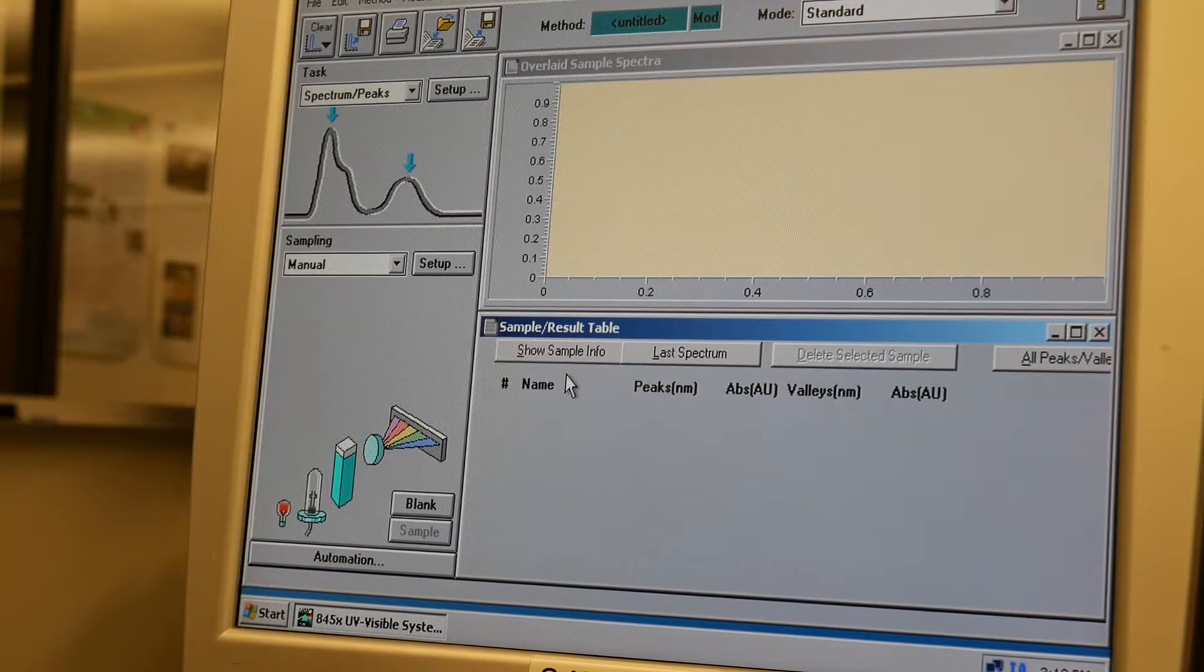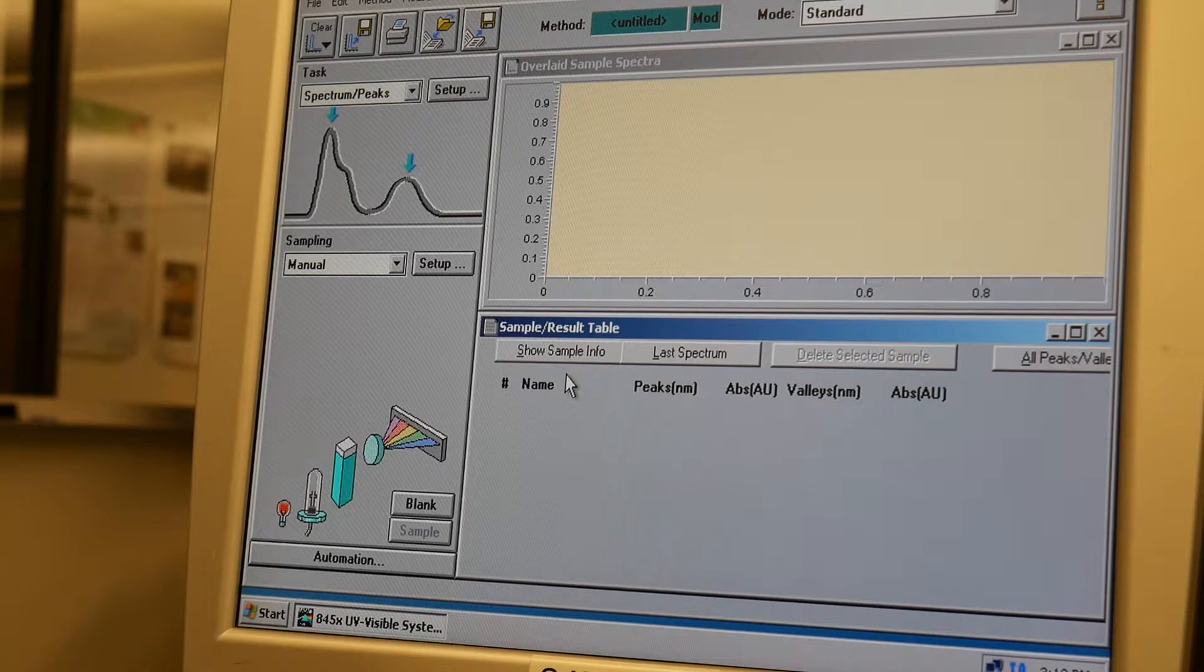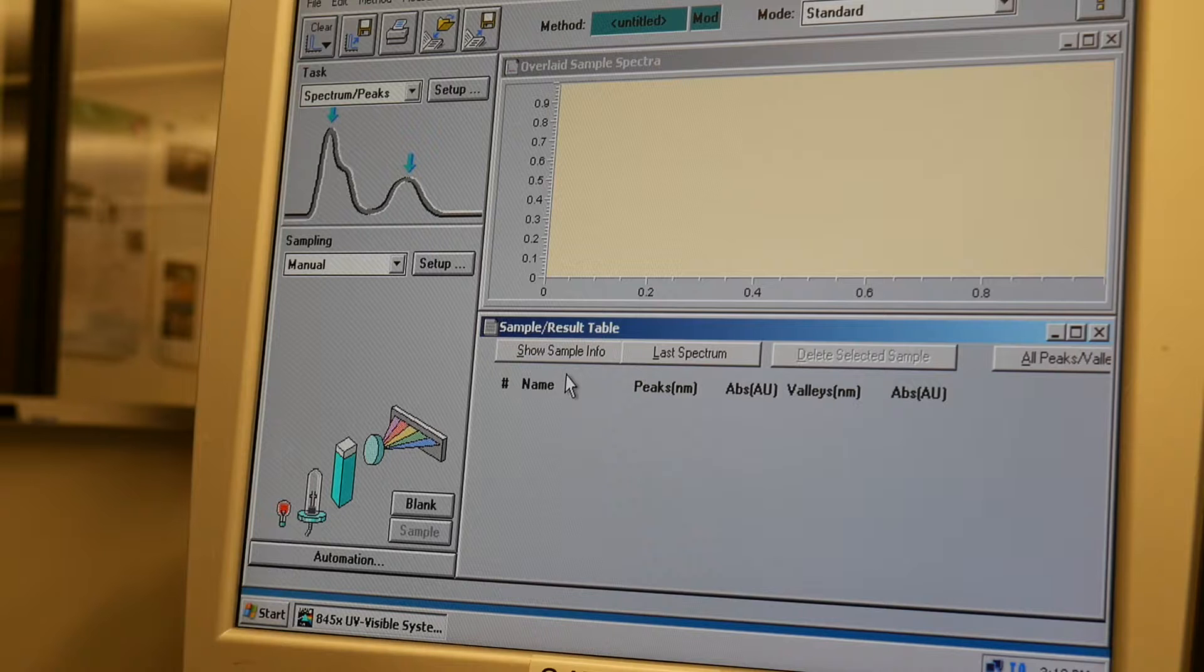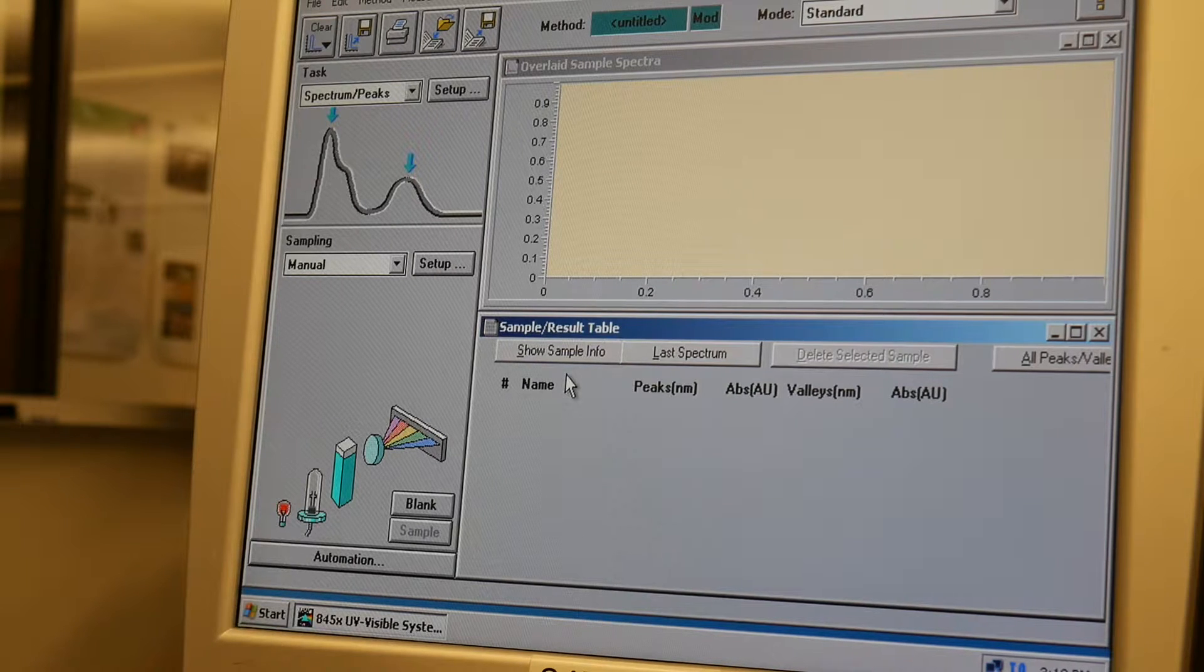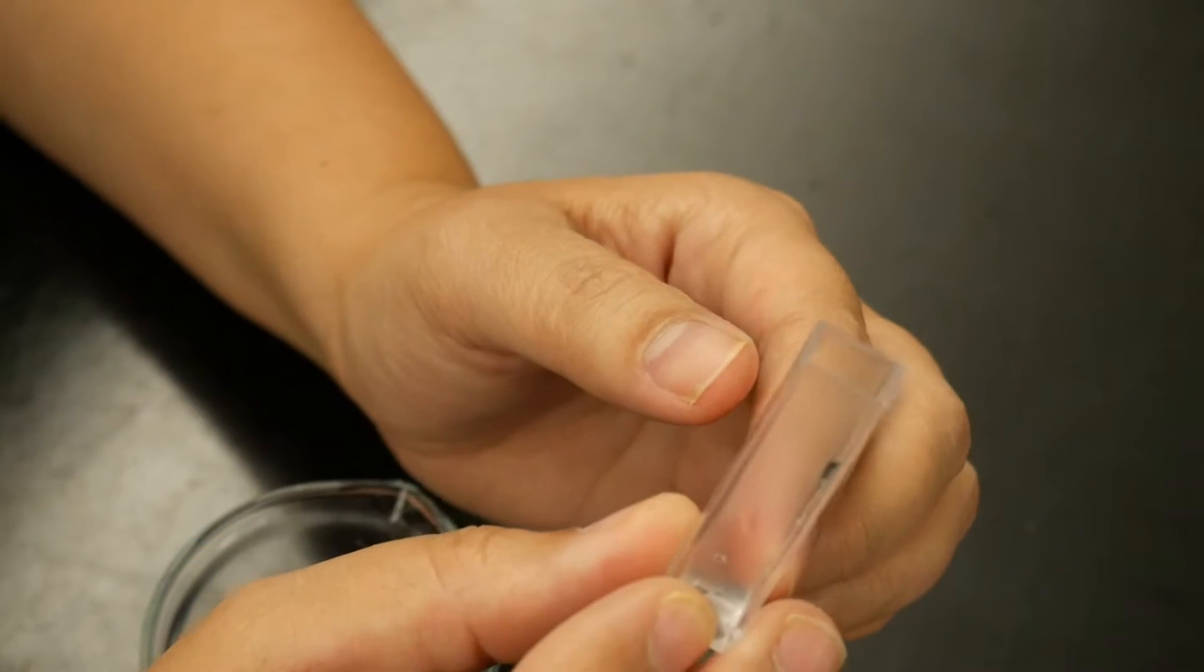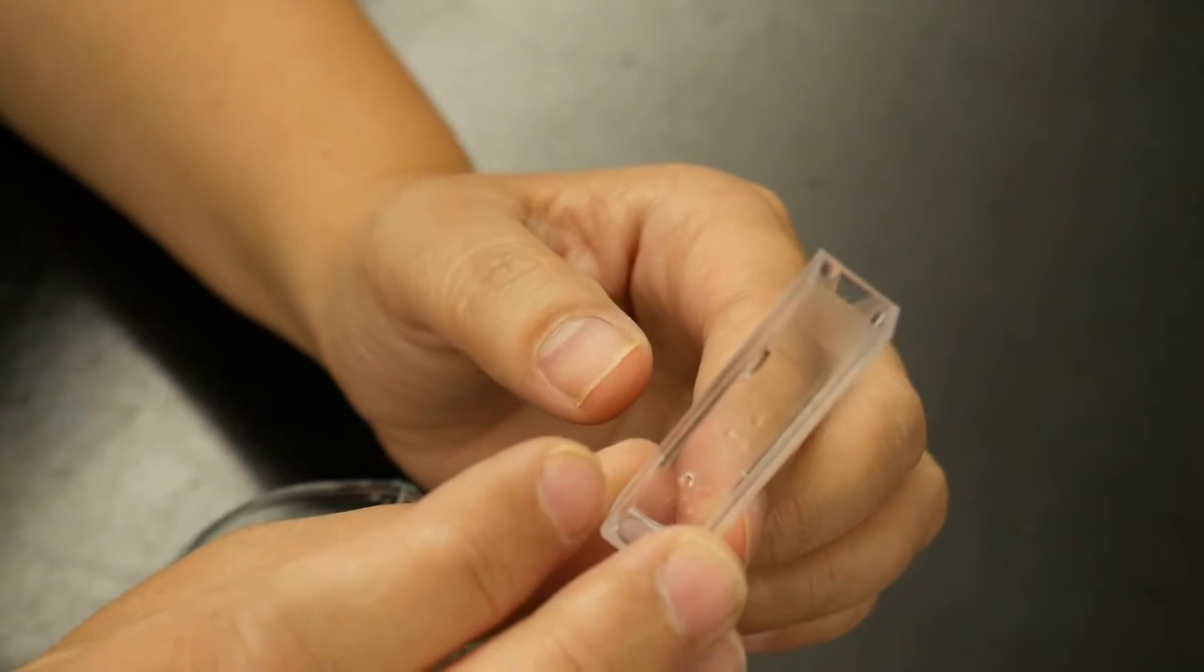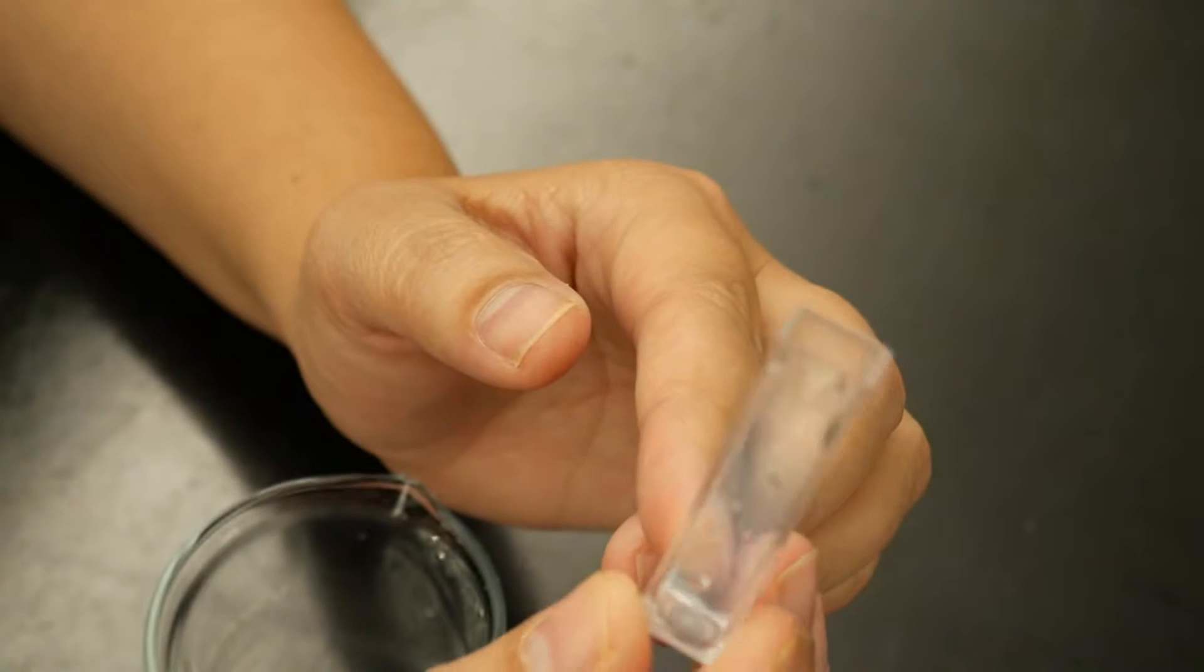And the first thing you want to do before you run any samples is you want to run a blank. And so if you are looking at something where you have reacted something, like if you're doing a colorimetric method, you'll want to do a reagent blank. But for now I'm just going to do a DI water blank. So this is a cuvette. We have a variety of cuvettes. This particular one holds three and a half mils. There are also cuvettes that hold one mil.